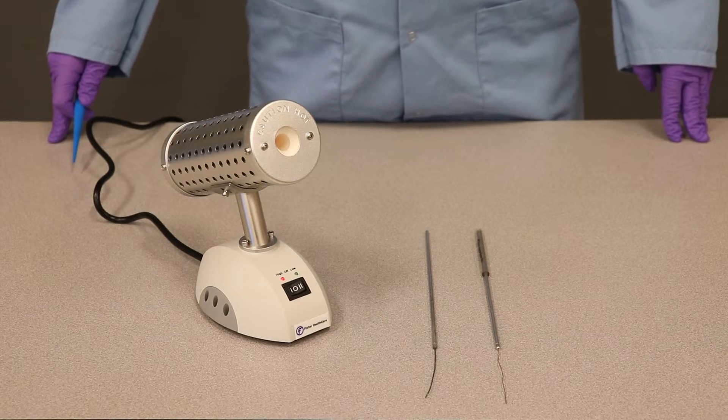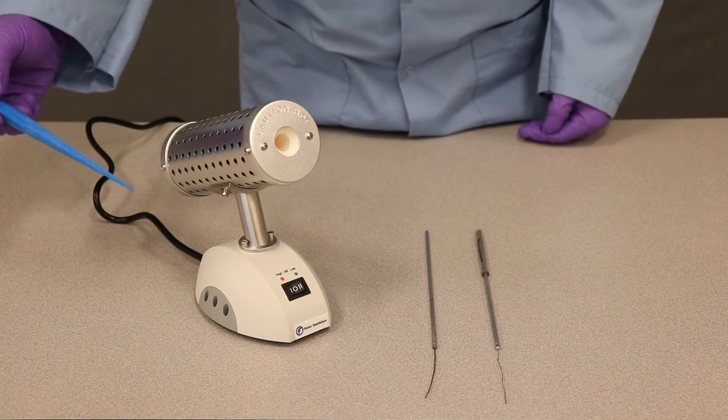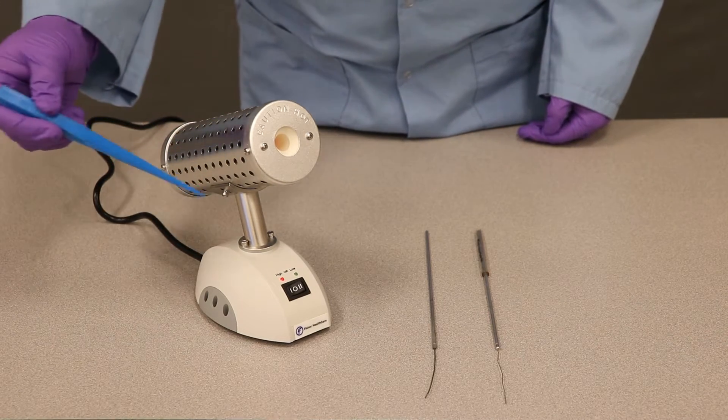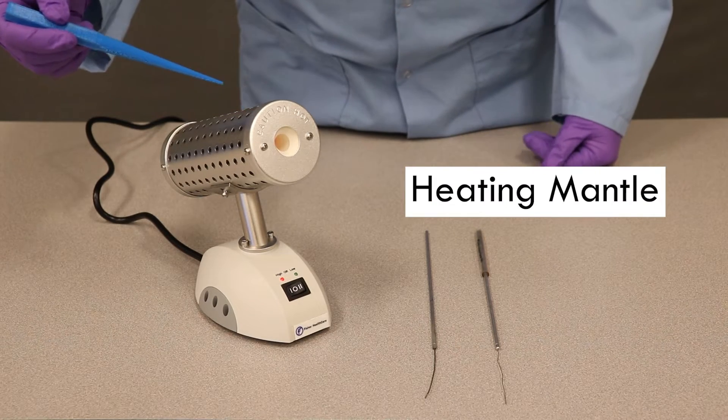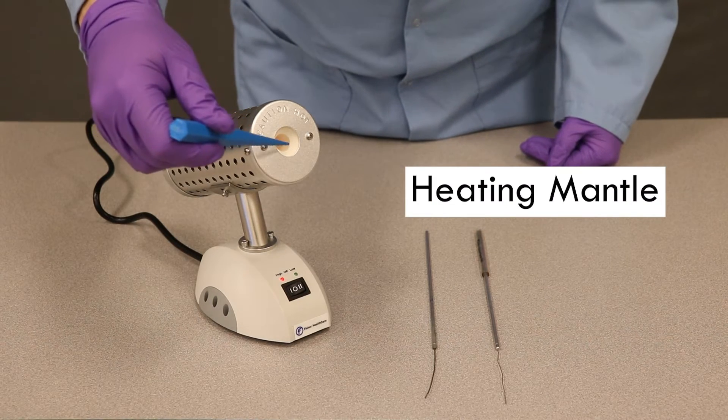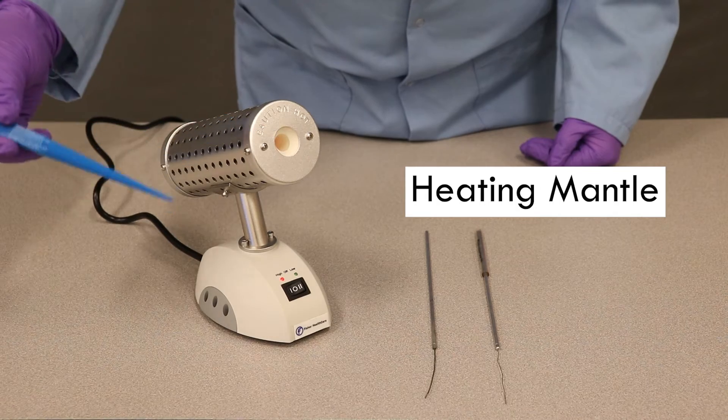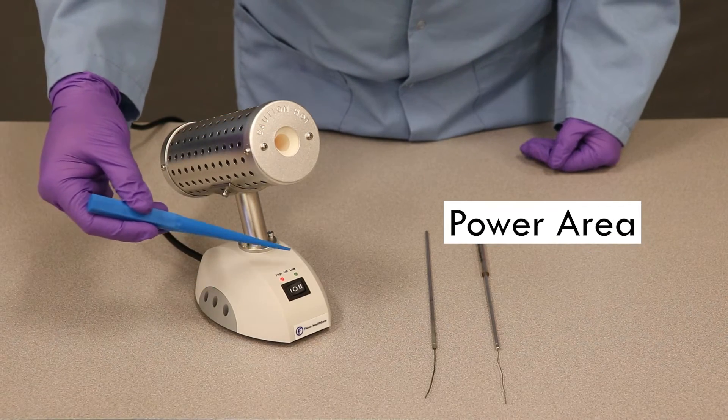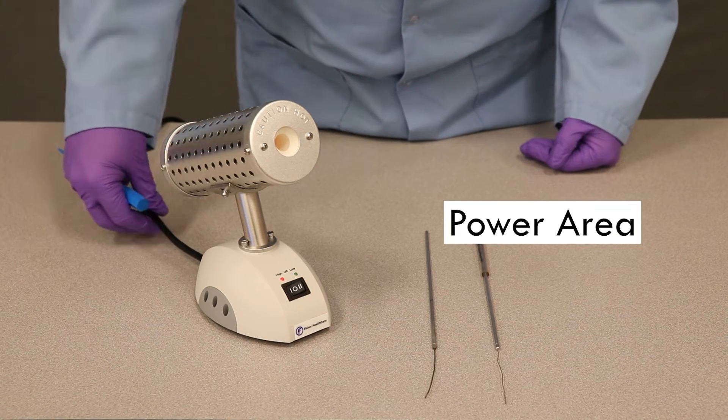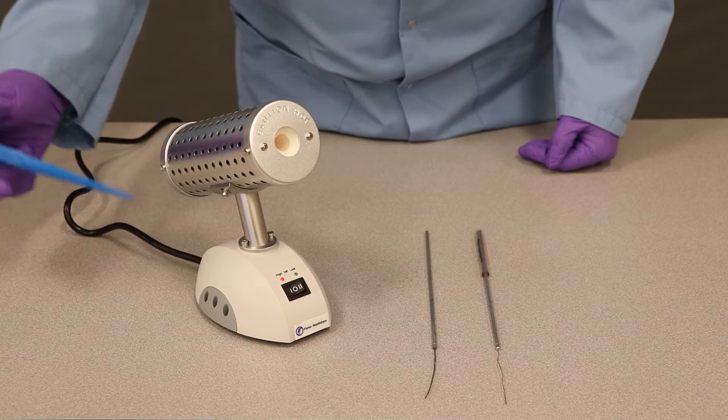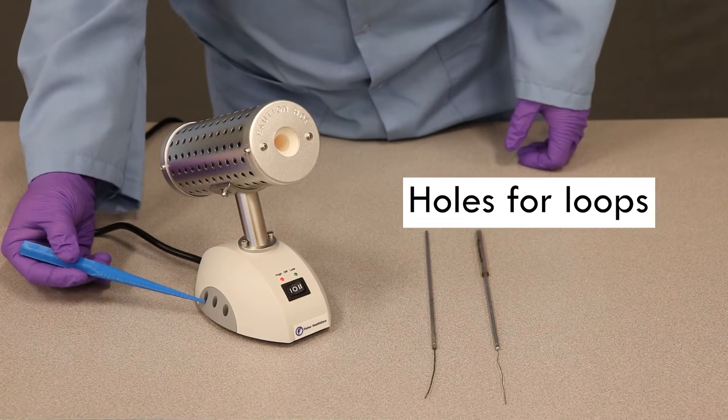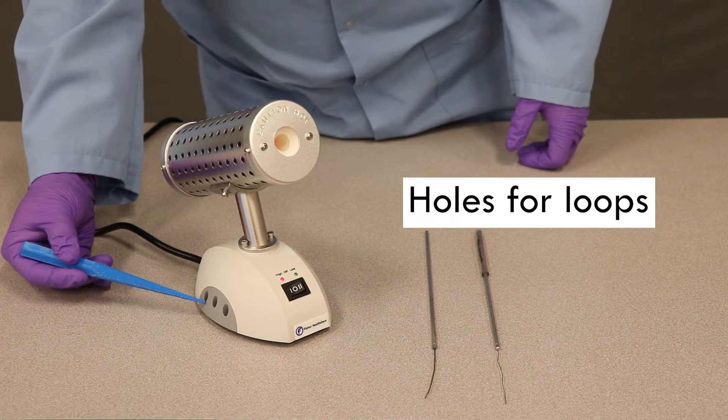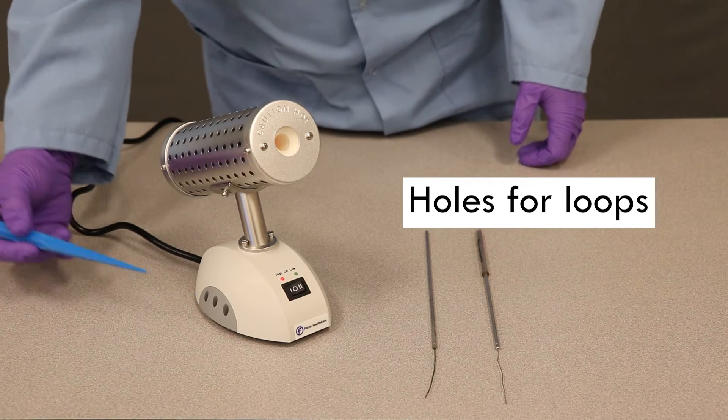The parts of the Bact incinerator are as follows. This long metal cylinder is known as the heating mantle. Inside is where you will actually be putting the loop. This is the power area with the on-off switch and the cord, and these are some small holes on the side that can be used to hold inoculating loops when not in use.